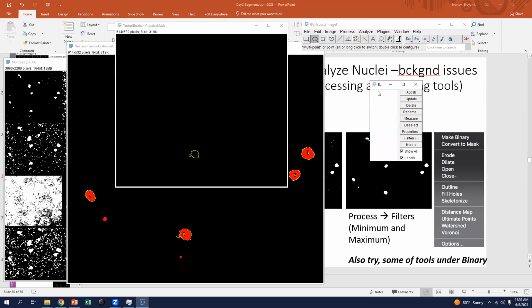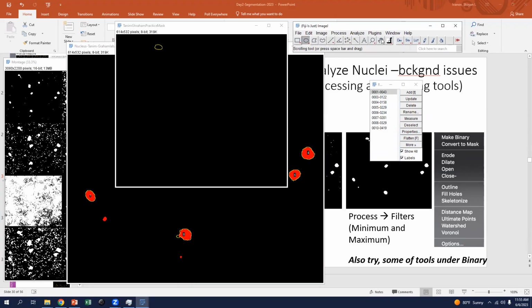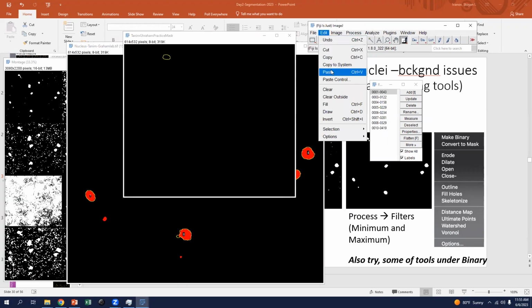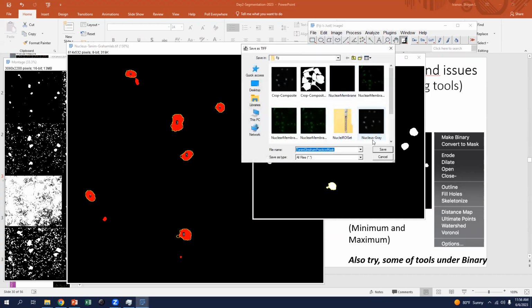So from the ROI, we can select an ROI. We can go to Edit and Fill, but first we want to make sure we're going to fill it with the right color. So if we right-click this, we want white and black, I believe. And that's going to make our fill color white. So we come in and we press Fill, or Control F. And we can do that for every mask. And then that's our mask. We can save it, make sure it's there.